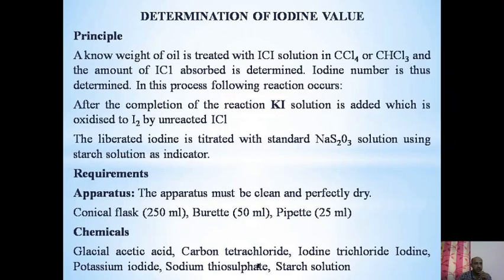When this is added to a solution to be tested, any chemical groups, usually in this test C=C double bonds, that react with iodine effectively reduce the strength or magnitude of the color by taking the iodine out of the solution. Thus, the amount of iodine required to make a solution retain the characteristic yellow or brown color can effectively be used to determine the amount of iodine-sensitive groups present in the solution.